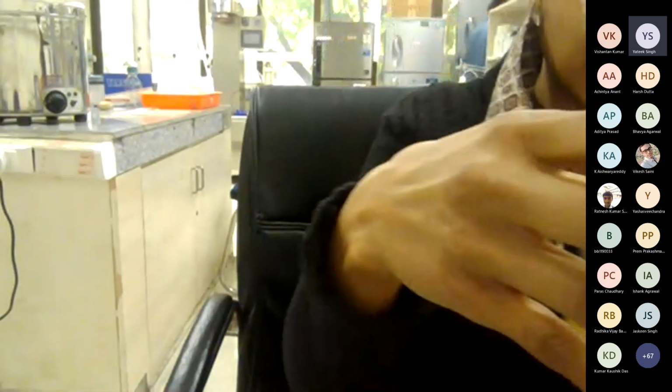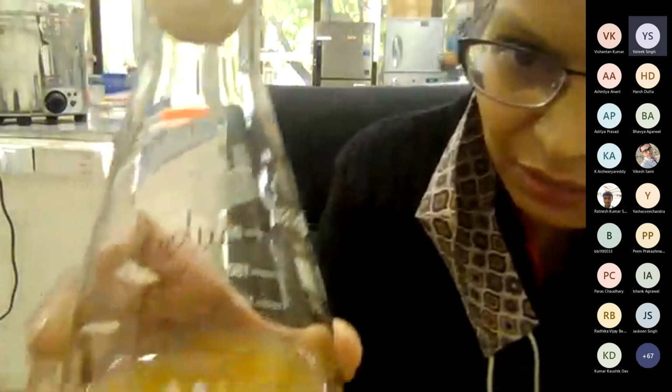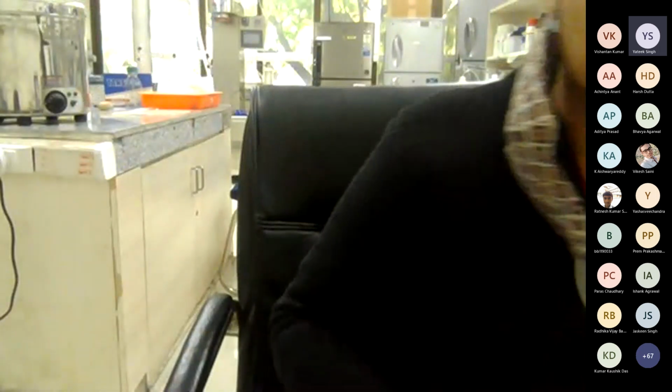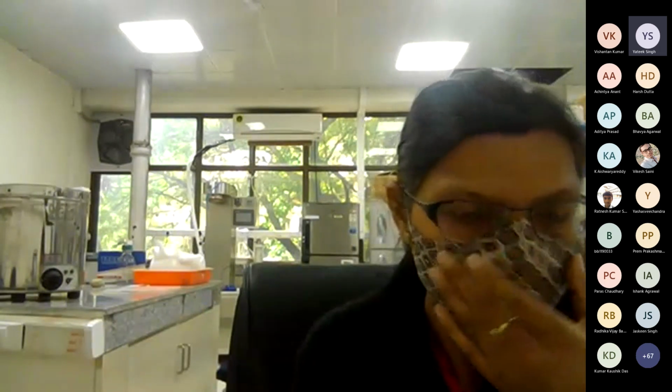After these cultures are in early log phase, we induce one of our cultures. This is our induced flask. Why induce? Why do we need an induction? We need an induction because there are proteins we need to study, to see if there is any leaky expression or not.